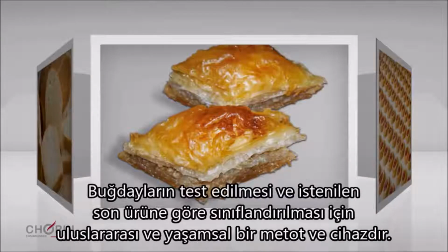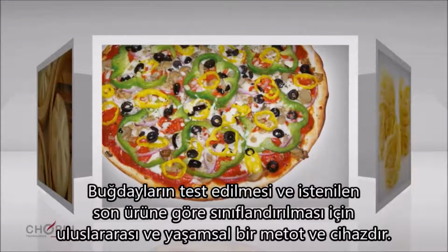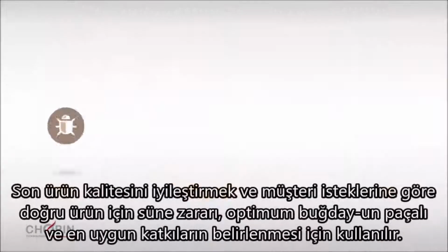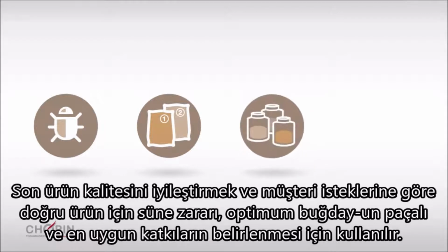It is internationally recognized as the essential and standard tool for testing and classifying wheats in accordance with their future use, detecting insect damage in wheat, defining and optimizing wheat and flour blends, selecting the most suitable additives to improve final product quality, verifying product conformity to customers' specifications.